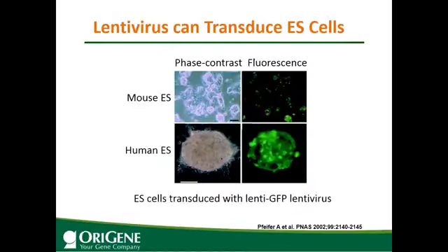And this data shows lentivirus can transduce ES cells, embryonic stem cells. The lenti-GFP virus was used to infect both mouse and human ES cells, and the pictures were taken 2 weeks after infection. The left panels were phase contrast showing the cells, and the GFP green cells were infected cells. So this data demonstrated that lentivirus is a powerful gene delivery tool for ES cells.